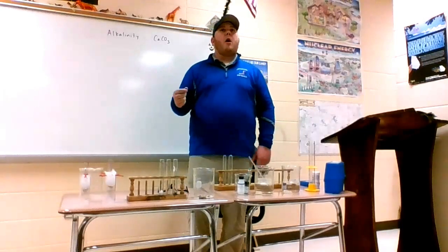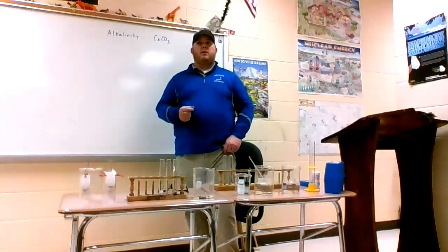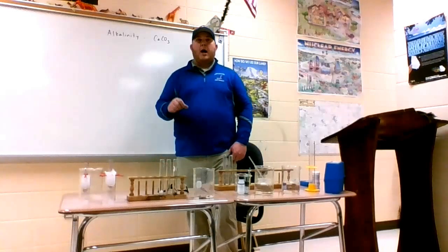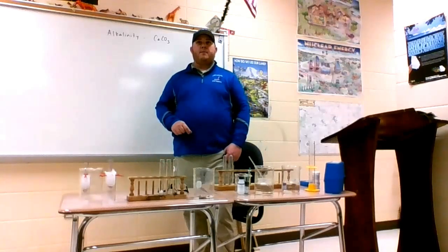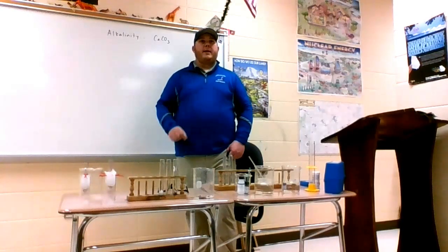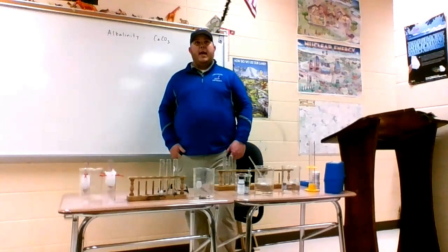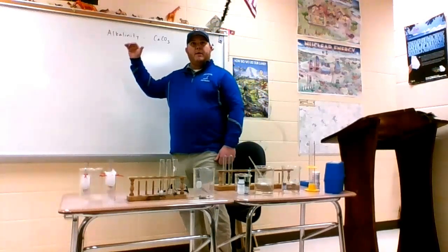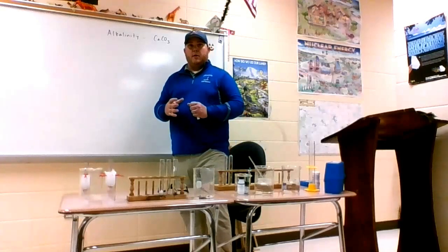What's the pH of that water going to do? Go down. Immediately? Maybe. One drop, is that going to make the pH go down? Depends. Two drops? Well, more than one drop. Could one drop make the pH go down? Yes. Okay. And it all depends on the alkalinity of that sample water.